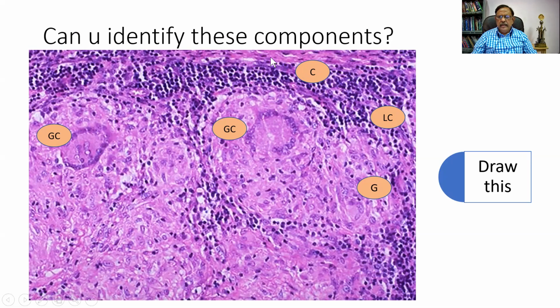I am finding a collagen-like material that is surrounding the lymph node. And the dark cells are the lymphocytes. You identify a lymphocyte by the cells which are small, dark, and uniform. The cytoplasm is scanty. This itself is a clear indication that it is a lymphocyte.